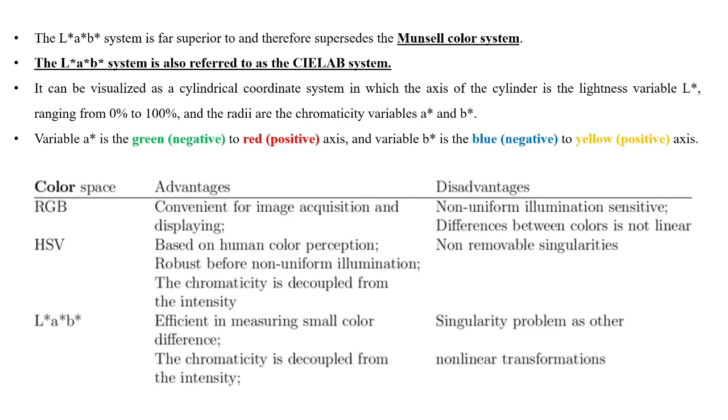Now coming to the different color spaces. Actually, to describe a color, there are various color spaces. First one everybody knows, RGB, right? Red, green, blue. The primary colors that we use to get any color from that, right?